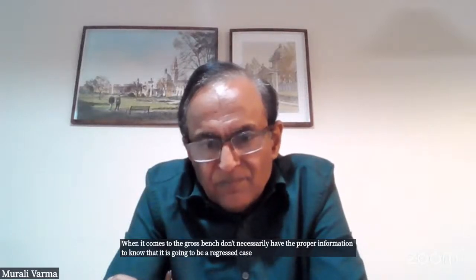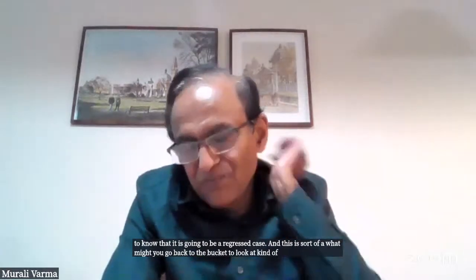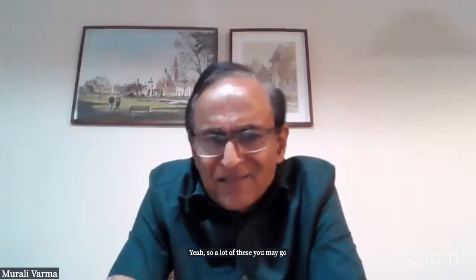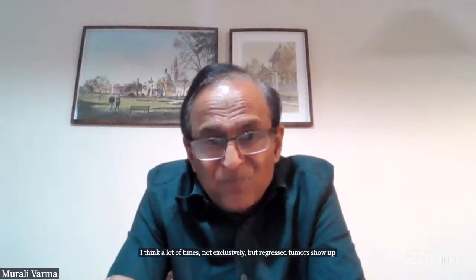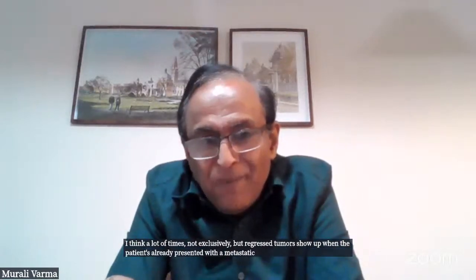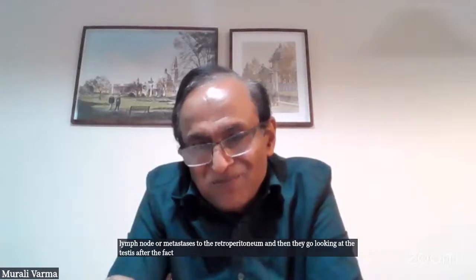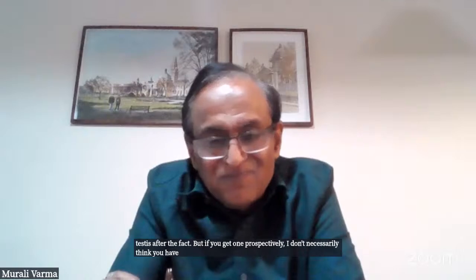And this is sort of a what might you go back to the bucket to look at kind of question for a lot of these. Yeah, so you may go back and take more sections, isn't it? I think a lot of times, not exclusively, regressed tumors show up when the patient's already presented with a metastatic lymph node or metastases to the retroperitoneum, and then they go looking at the testis after the fact. But if you get one prospectively, I don't necessarily think you have to put through the entire scar area.